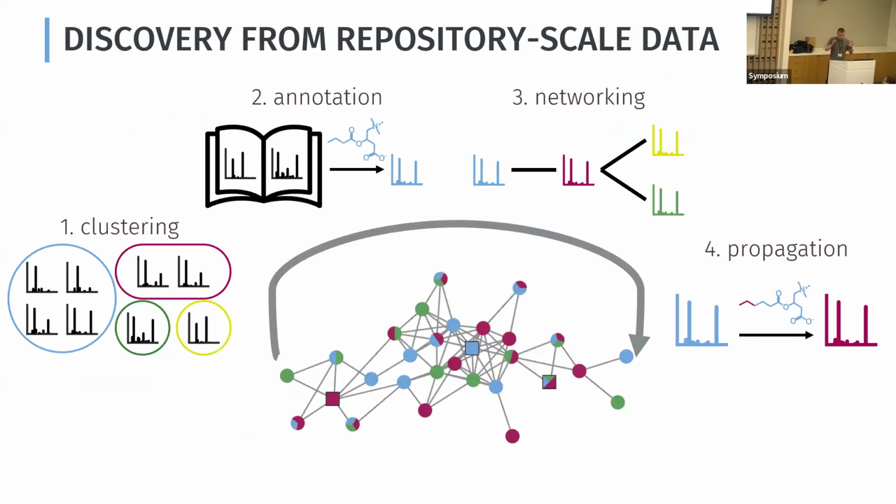And so, these projects, the clustering and the molecular networking, we're still working on both optimizing and finalizing. But we hope to then plug them into this entire workflow to generate our suspect spectral library, as well as some other ideas to improve the annotation part, propagation. We now have modifinder as well that could be used to get more information for these suspects. With those advances, we should be able to derive much more information from our repository scale data analysis and generate valuable structural hypotheses for previously unexplored spectra.